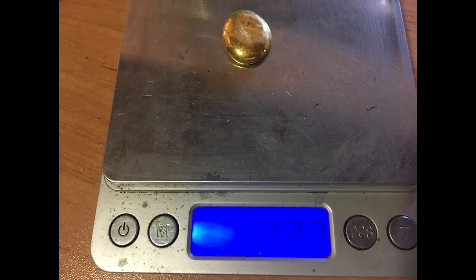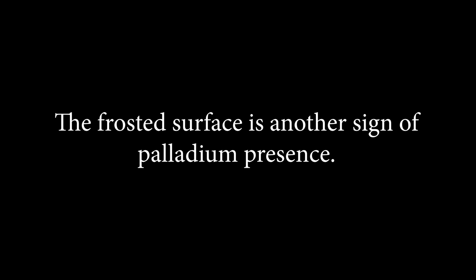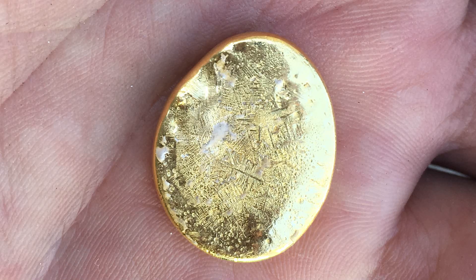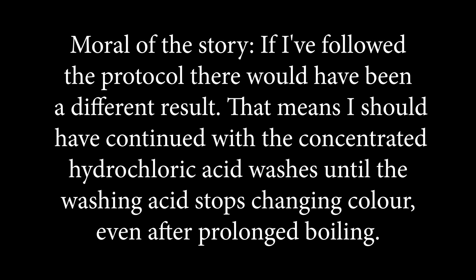This is not how pure gold should look like. The frosted surface is another sign of palladium presence. Moral of the story: if I had followed the protocol there would have been a different result. That means I should have continued with the concentrated hydrochloric acid washes until the washing acid stops changing color, even after prolonged boiling.